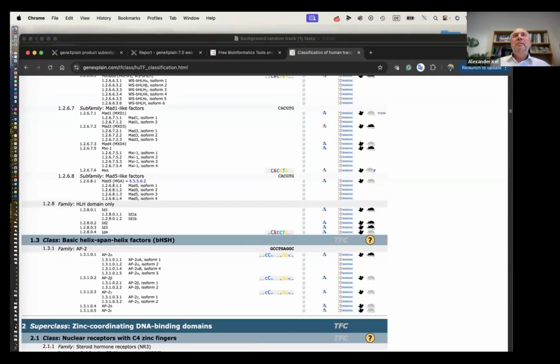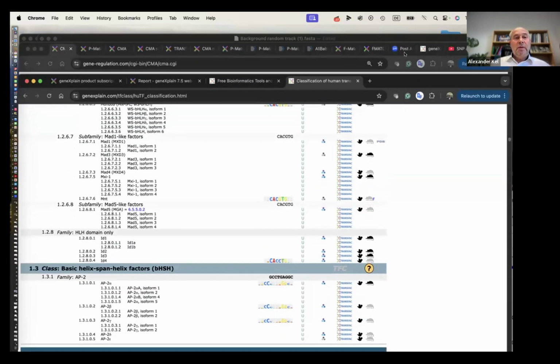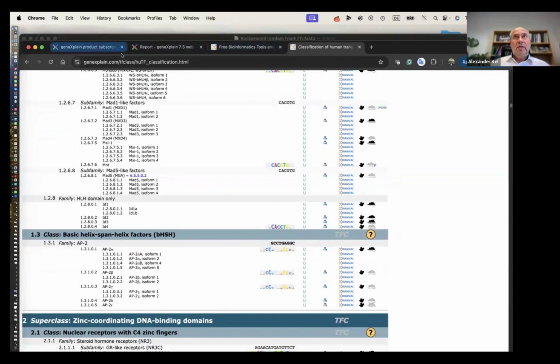All right. Another question. Can I predict nucleotide positioning as well as TF with CMA? All right, so I'm not sure if I understood the question correctly. Nucleotide positioning. Maybe you mean revealing the motifs de novo. That's also possible. So de novo.